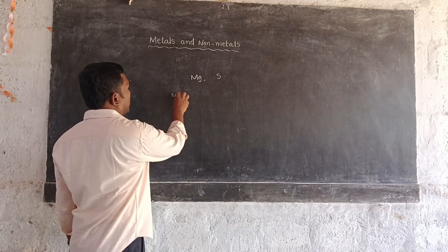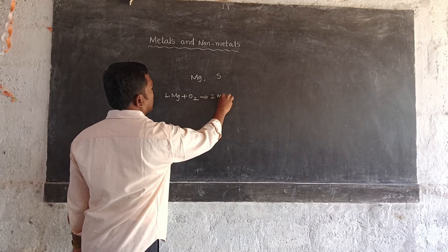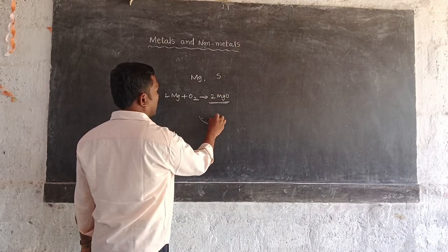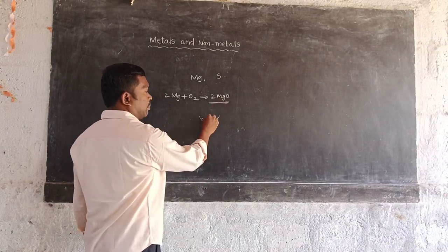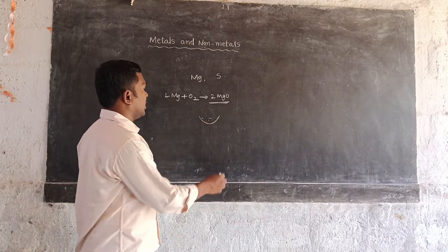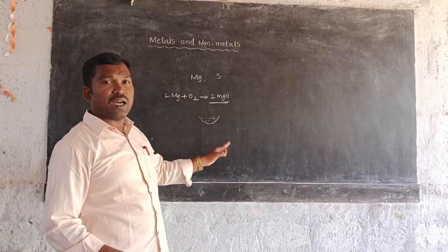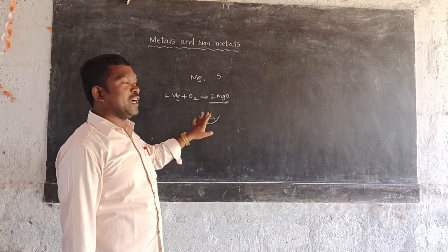Okay, when we burn magnesium ribbon, magnesium oxide is produced. This is the ash. Collect this ash in a china dish. Pour some water to the magnesium oxide ash and stir them. Now test the solution with blue and red litmus papers.